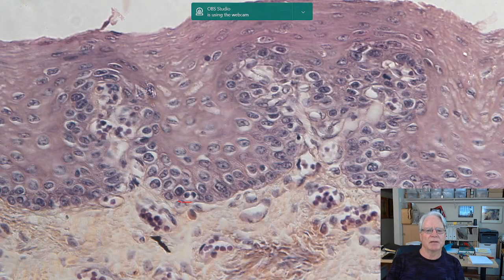Same thing. Here's the basal surface. Here's the outer surface, the apical surface. From here to here is my stratified squamous epithelium. So I get this thick covering of tissue. Sometimes, not always, but sometimes you can actually see that these cells are not flat.